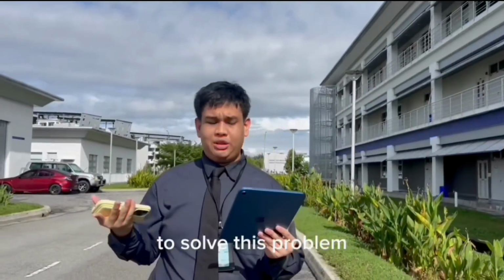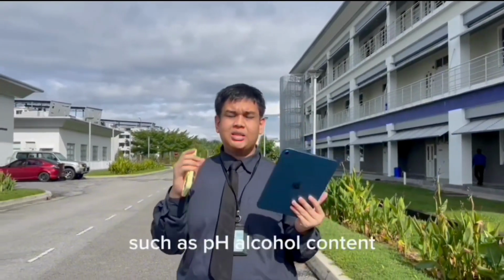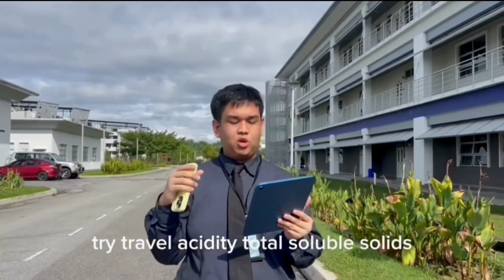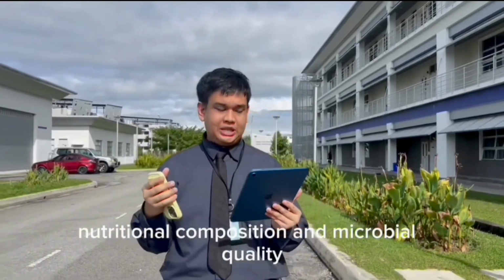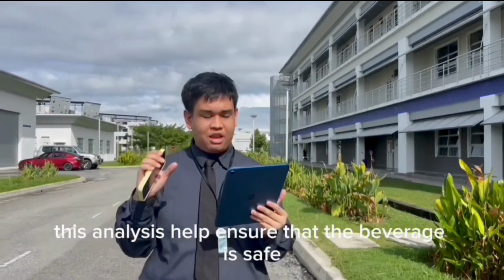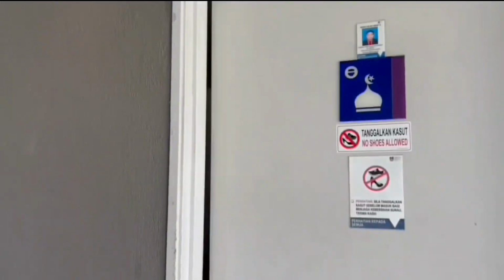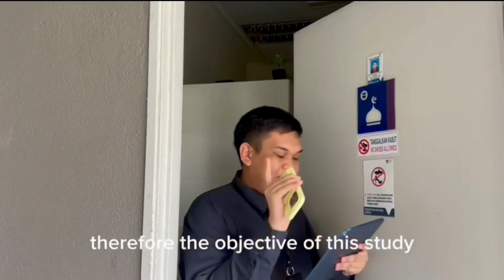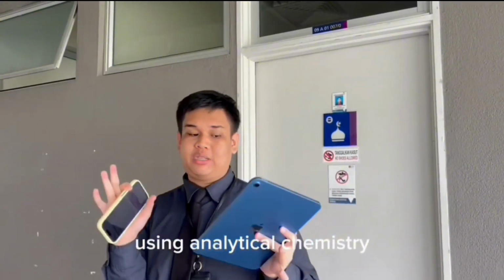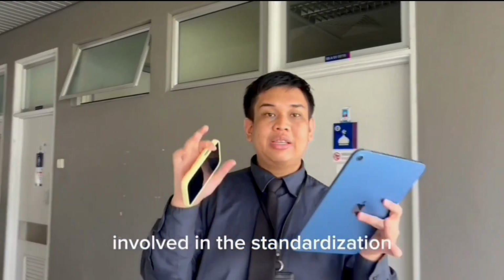To solve this problem, analytical chemistry is used to evaluate important quality parameters such as pH, alcohol content, titratable acidity, total soluble solids, nutritional composition, and microbial quality. This analysis helps ensure that the beverage is safe, consistent, and suitable for consumers. Therefore, the objective of this study is to standardize and characterize mead using analytical chemistry. In this video, we are focusing on the volumetric analysis involved in the standardization.